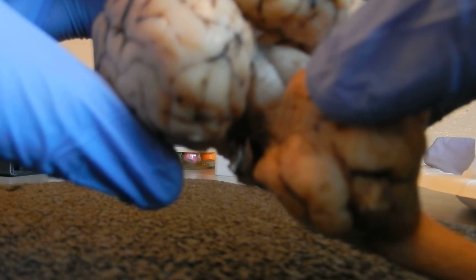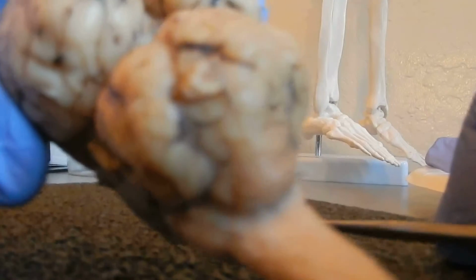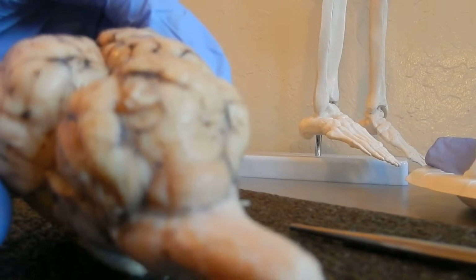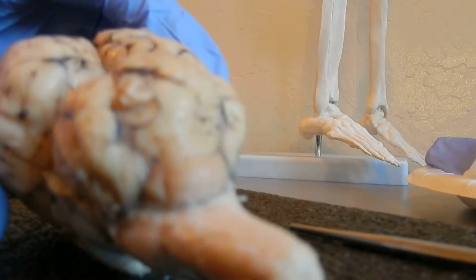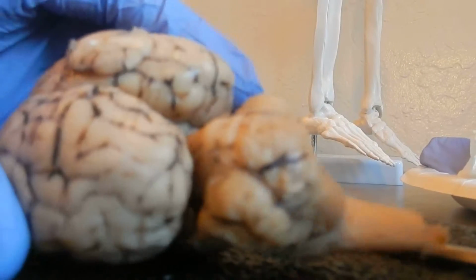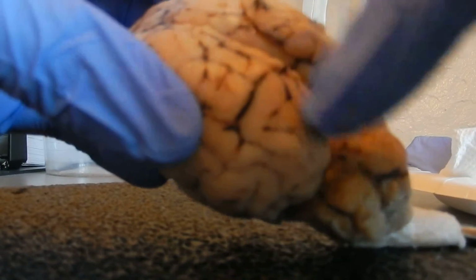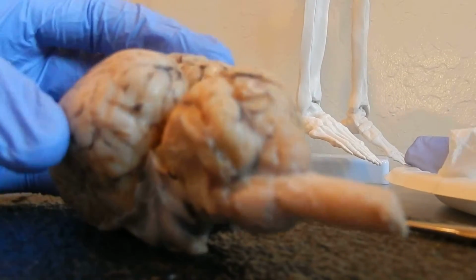All right, so we'll pull that here. You'll see the corpora quadrigemina. Alrighty, and so we're just going to point out a few other areas here in our sheep's brain. We're going to do a sagittal dissection, and we'll check out our sheep's brain here.